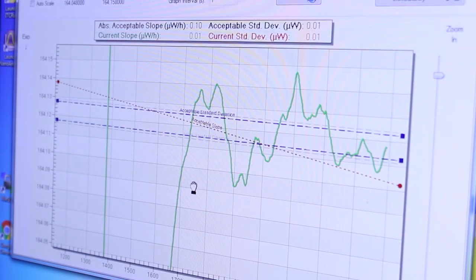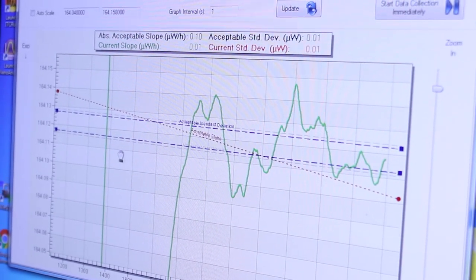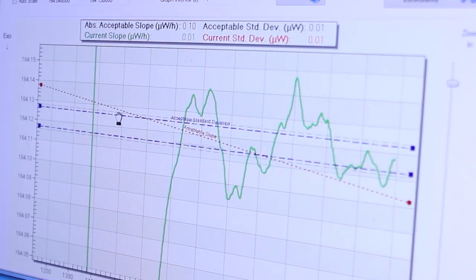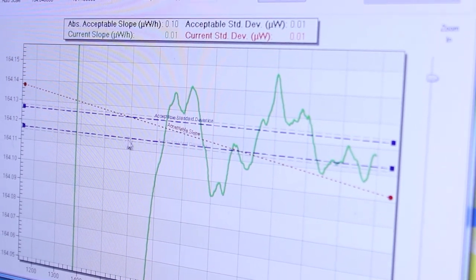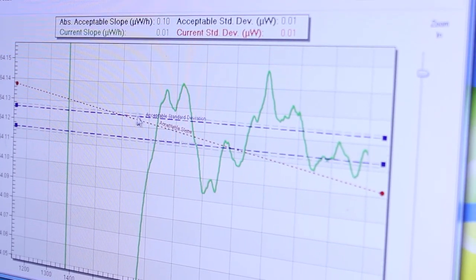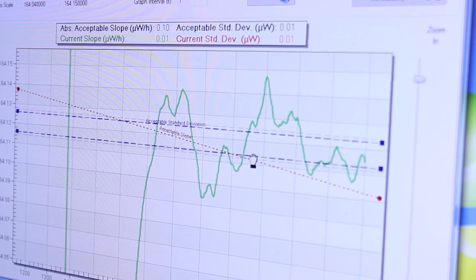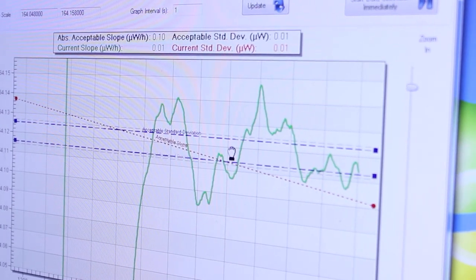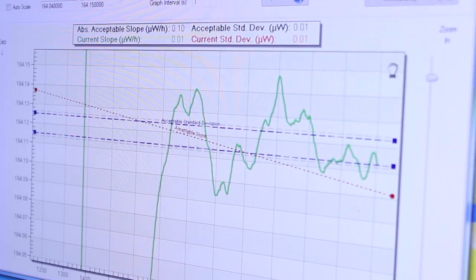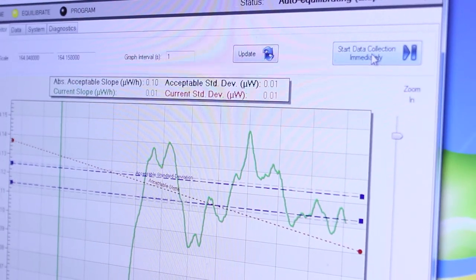If we zoom in we can see now that the gray line has almost reached the blue line in terms of the acceptable standard deviation. We're going to in this case say that it's close enough so now we can go to start data collection immediately.